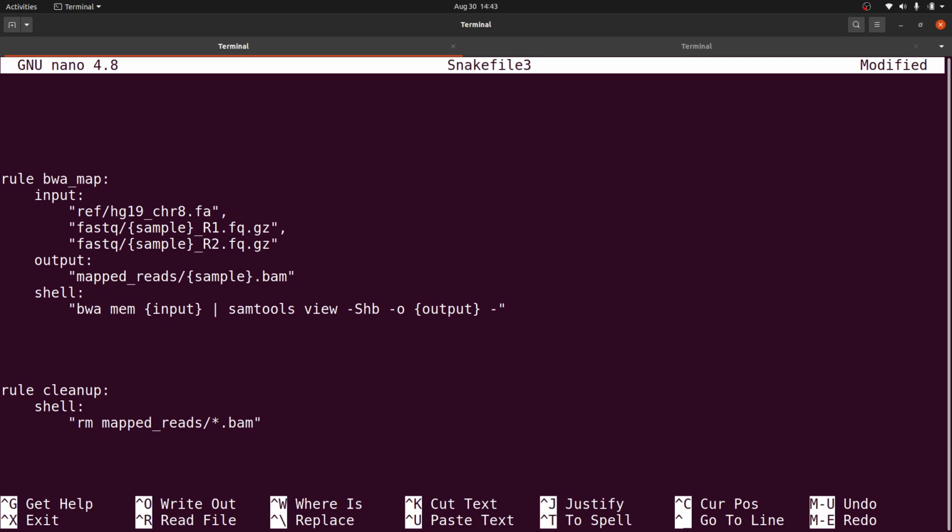All right, so I can say samples equals, and I'll bring a bracket like this, Python style. These are square brackets. We use them to define lists. For those who don't know, list is a data type in Python. I have a tutorial on that, so if you're interested, check the description box. The link to that video is there.